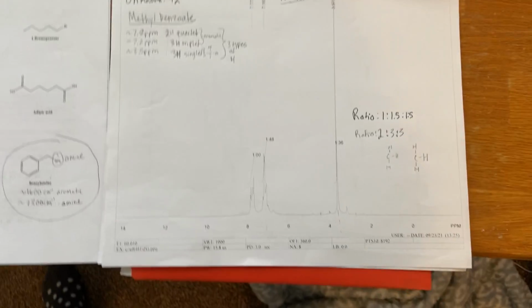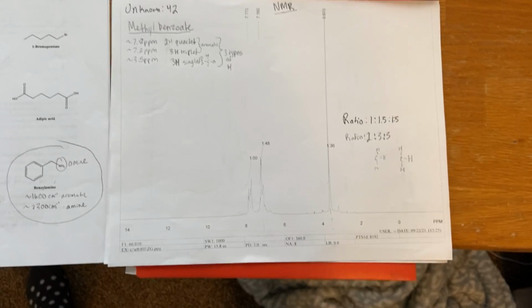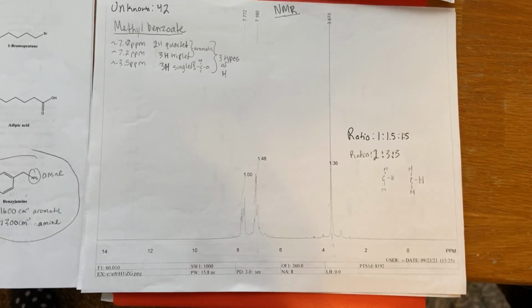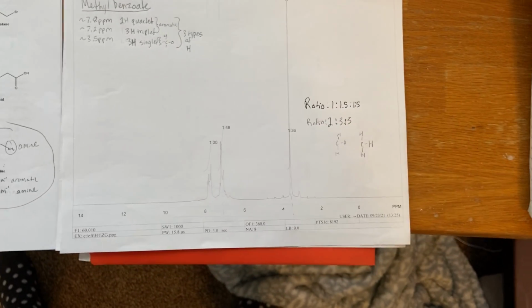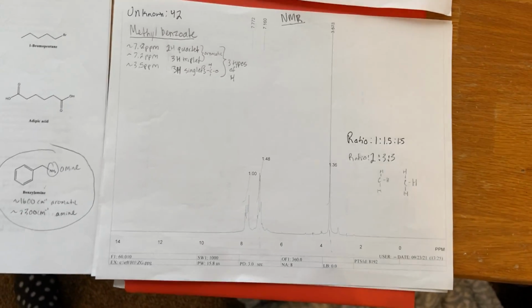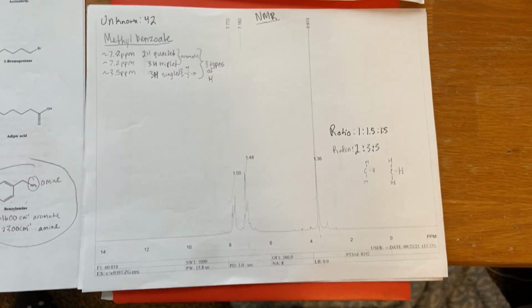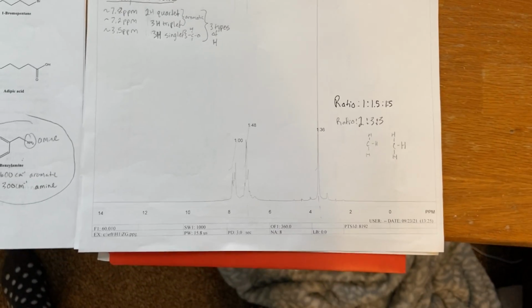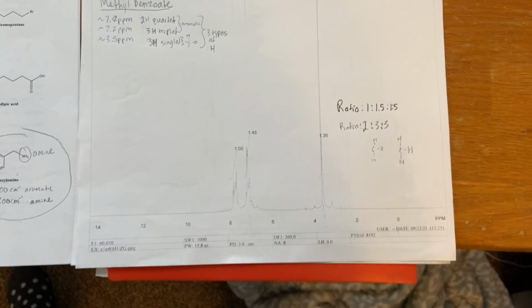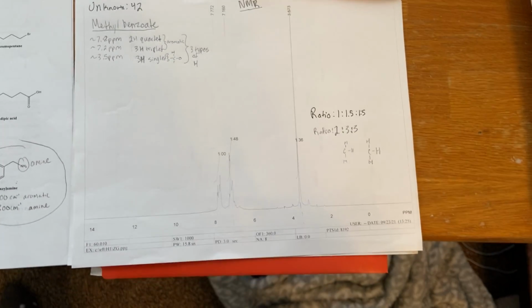And then the next thing that we did in this lab was find the NMR of a specific compound. In order to do this, the unknown was placed in a tube with CDCl3 at about 50-50 of the compound and the CDCl3, and was mixed through inversion. Then the tube was placed in the NMR machine and pushed down, and then we used the computer to actually create the spectrum.